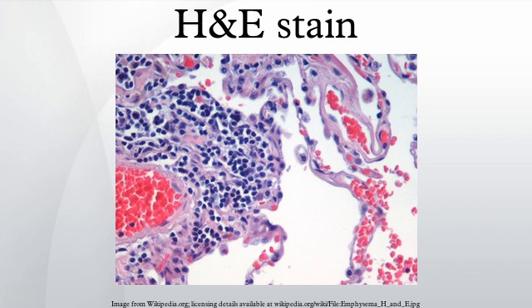Other colors, for example yellow and brown, can be present in the sample. They are caused by intrinsic pigments, for example melanin. Some structures do not stain well. Basal laminae need to be stained by PAS stain or some silver stains, if they have to be well visible. Reticular fibers also require silver stain. Hydrophobic structures also tend to remain clear. These are usually rich in fats, for example adipocytes, myelin around neuron axons, and Golgi apparatus membranes.